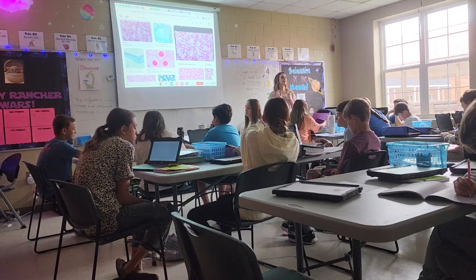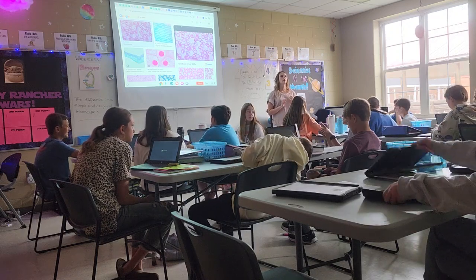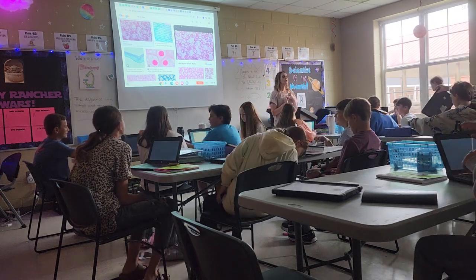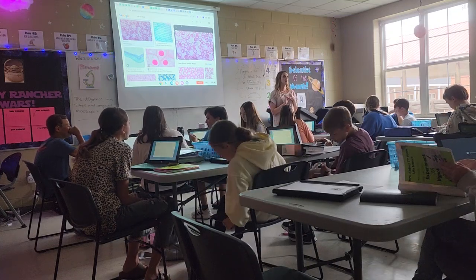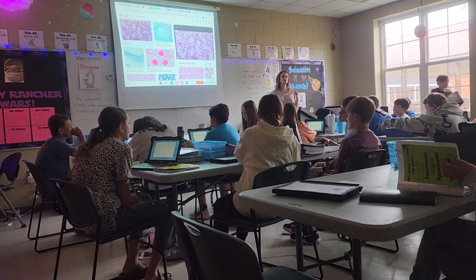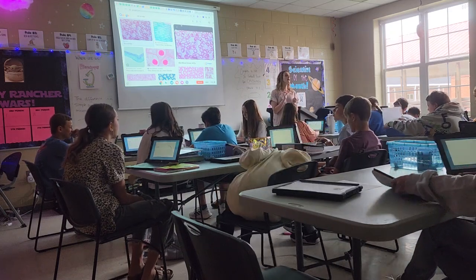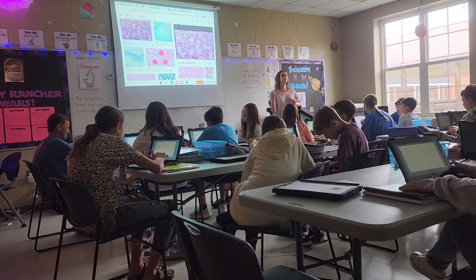Let's listen up guys, everybody eyes up front. We are going to Schoology. We are going to the folder labeled Unit 1, Cell Structure and Function. In that you will find the link for the Virtual Microscope Lab. When you click that link, it will take you to the next page where you will see the Virtual Microscope link. It's in blue. You'll click that. It's going to give you an error message, but you will click Continue, and it will take you to the website.